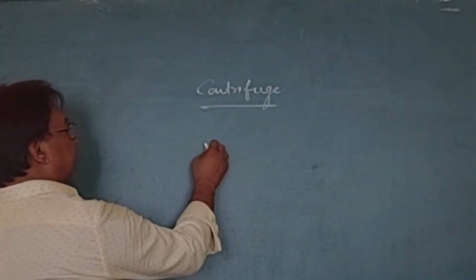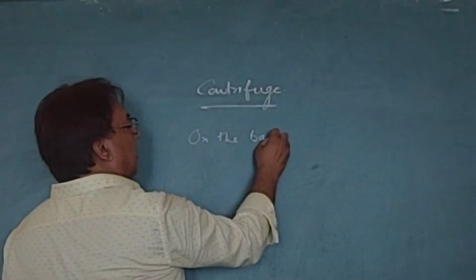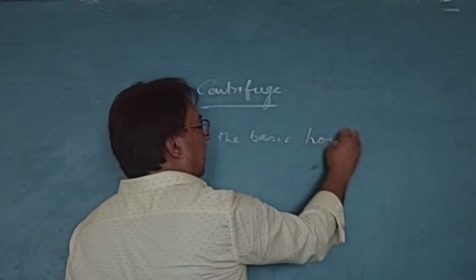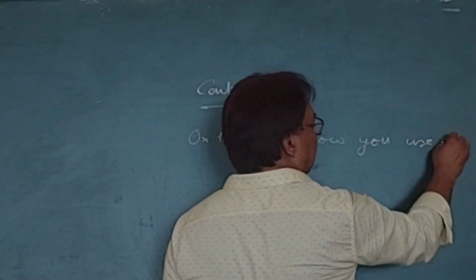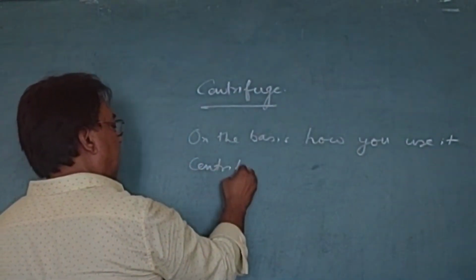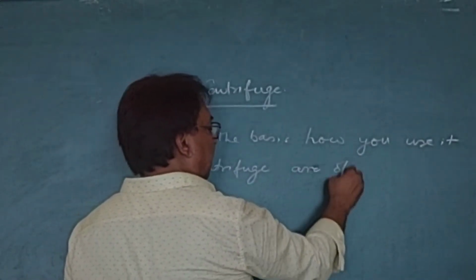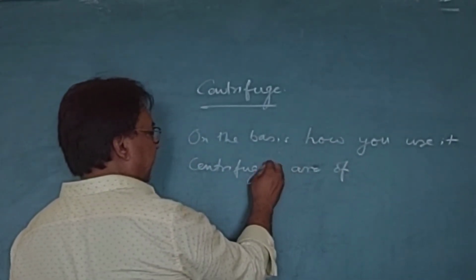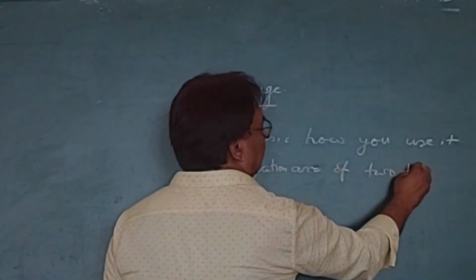On the basis of how you use it, centrifugation is of two types.